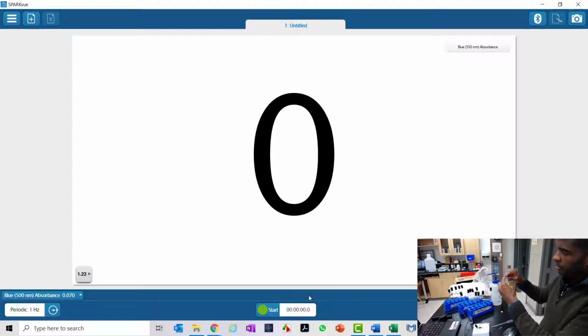I'm going to pour it in, it'll be easier. So that's my 10% methanol. Pour this in. My 20%. Putting the lids on in case I knock it over, it won't spill everywhere. 30%. Lid back on, and my 40%. Okay, so I've now poured off my methanol from 0 to 40%, and now I'm going to clean each one. Put the lid on. Clean each one.